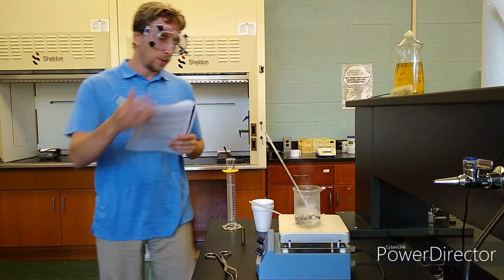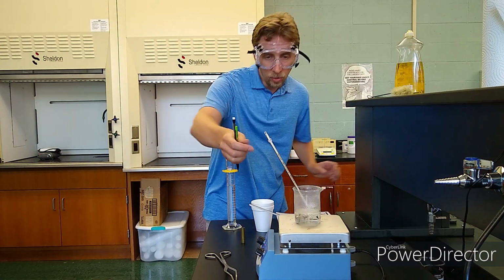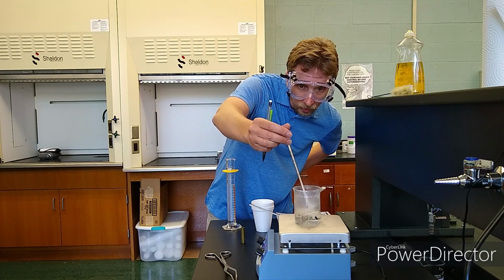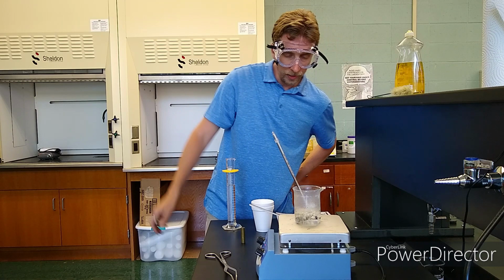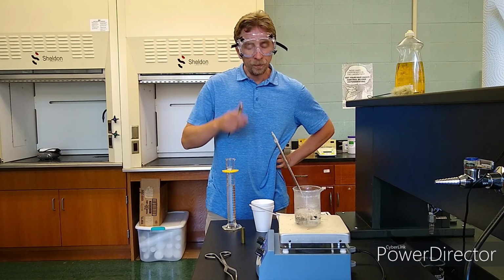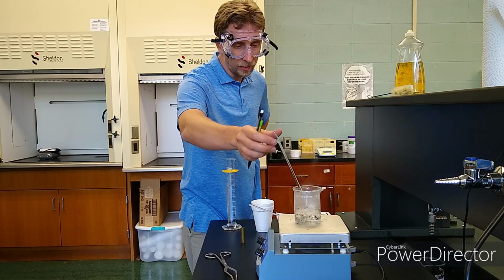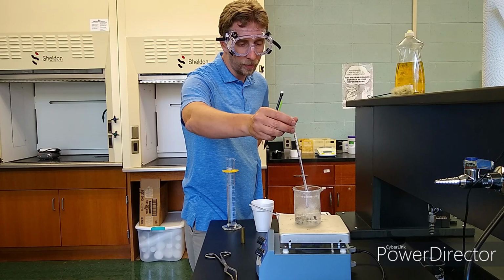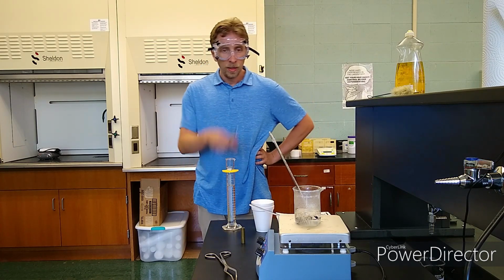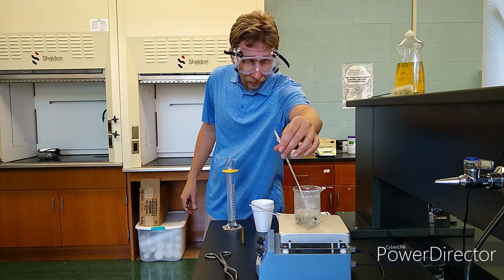All right, now you can see obviously that our water is boiling here, and it could be boiling away the whole time. My thermometer is looking at, well, right at 100 degrees Celsius. Okay, 100 with 3 significant figures is good enough for me. Now, it might read a little bit lower than that because it's not immersed as much as it's supposed to be in order to get the most accurate temperatures. But in this case, it's good enough.